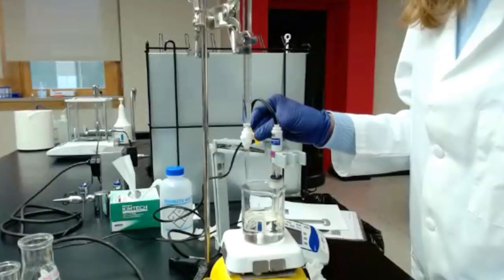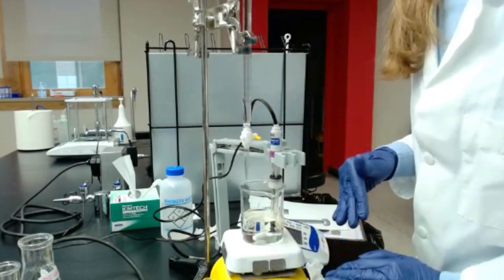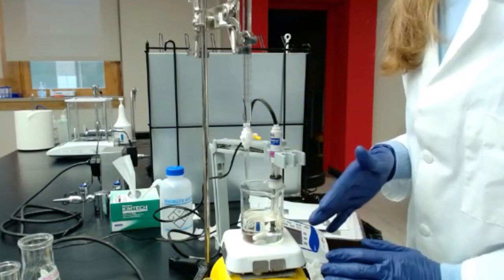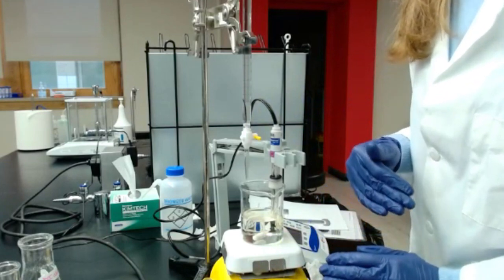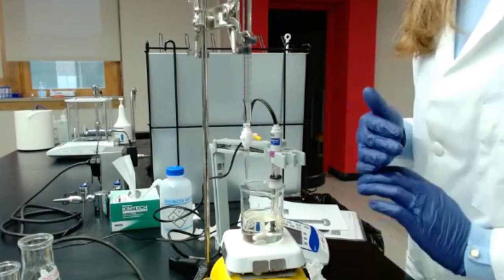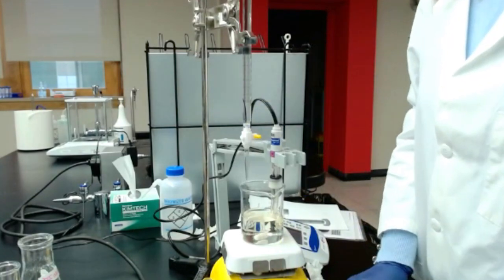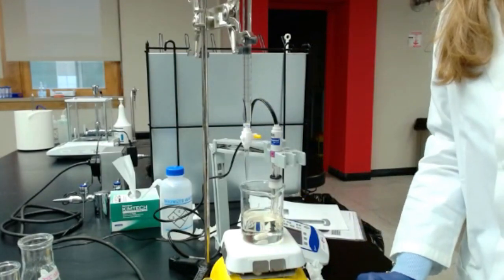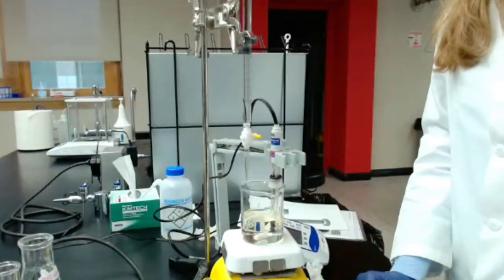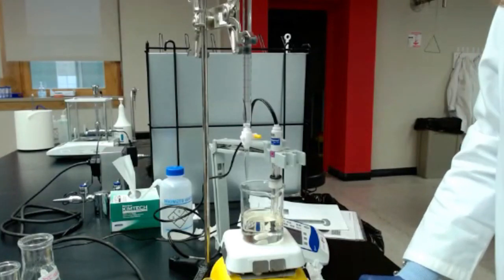You keep going until you reach pH 8.2, 8.20. If you have 8.25, that is fine. If you have 8.18, that is fine too. But don't be at pH 9, because that's going to be inaccurate. So to me, I'm done. I'm at pH 8, a little bit above, sorry. But I consider that I'm good.